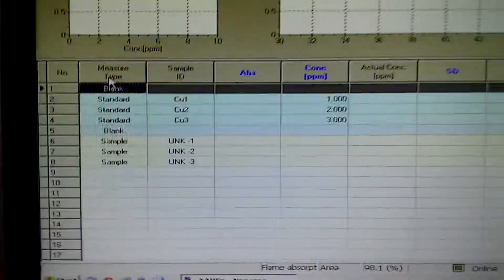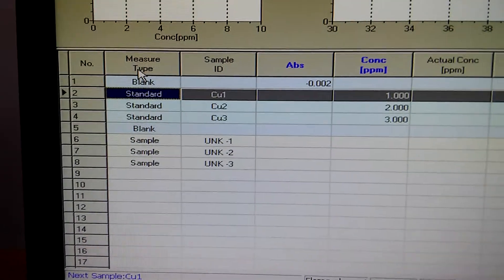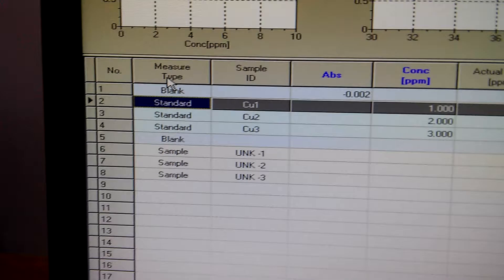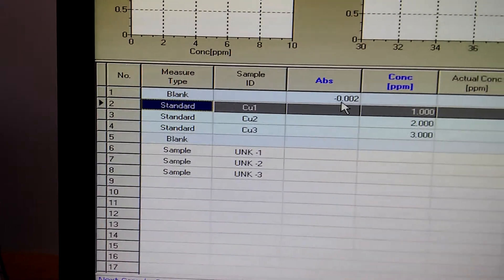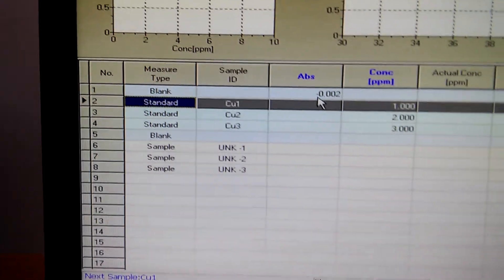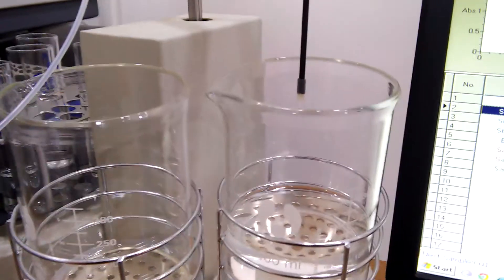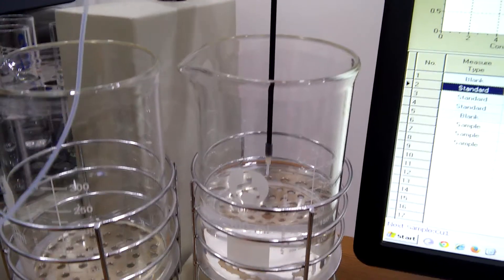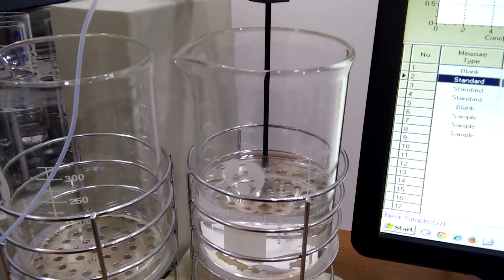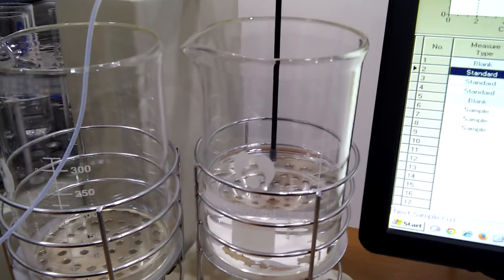We are waiting for the absorption of the blank. Now it will wash it again, wash the tubing of the auto sampler.